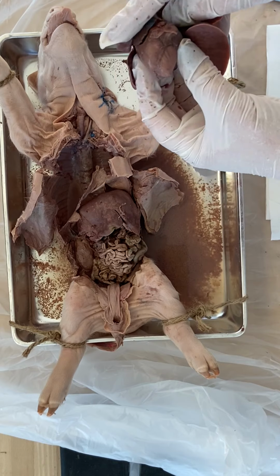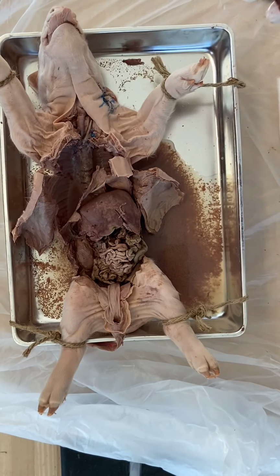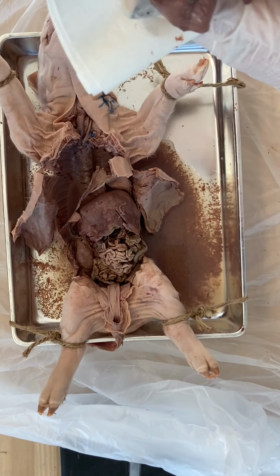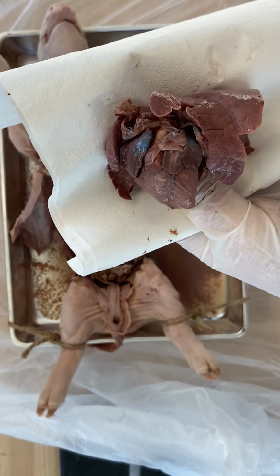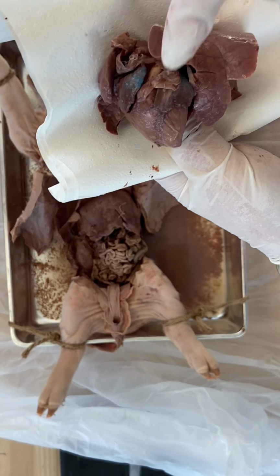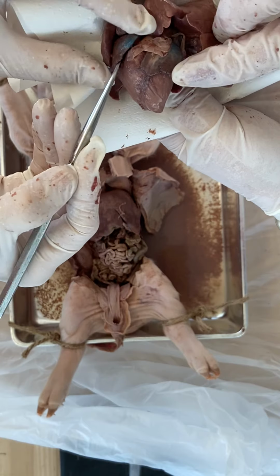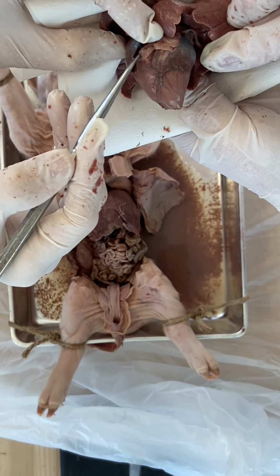So if we look on the outside of the heart, see if I can make sure you can see. Okay, so this is how we would be looking, as if we were looking at our diagram. So the right atrium is up here, the top here. And it's very stiff because it's preserved. But it is that little flap.